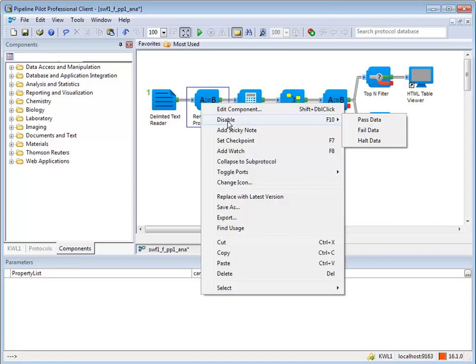Once a component is disabled, the option to enable it becomes available on this menu as well.